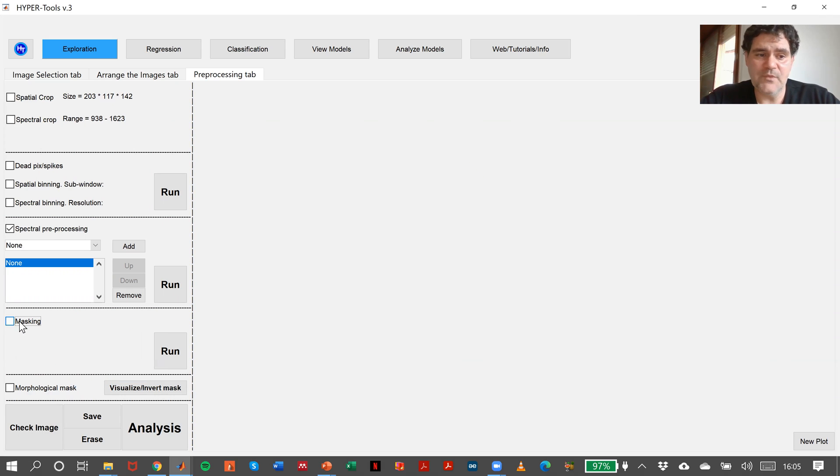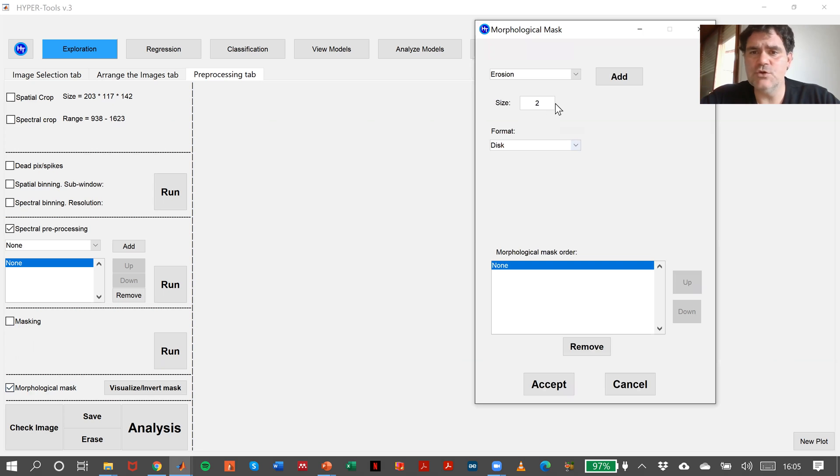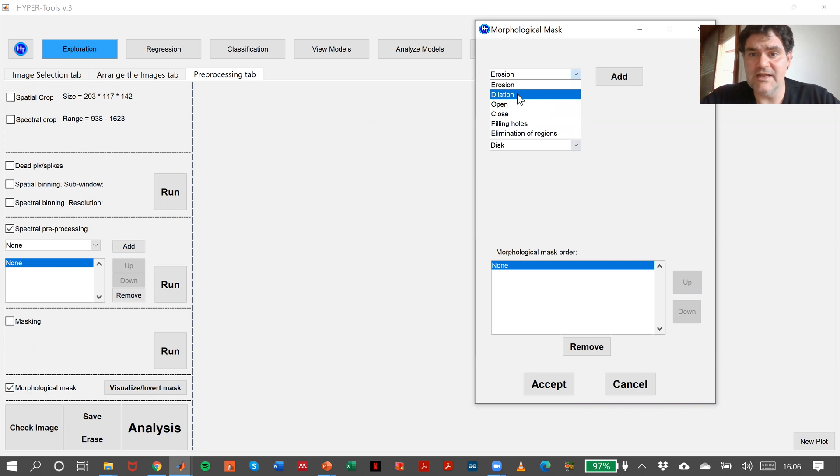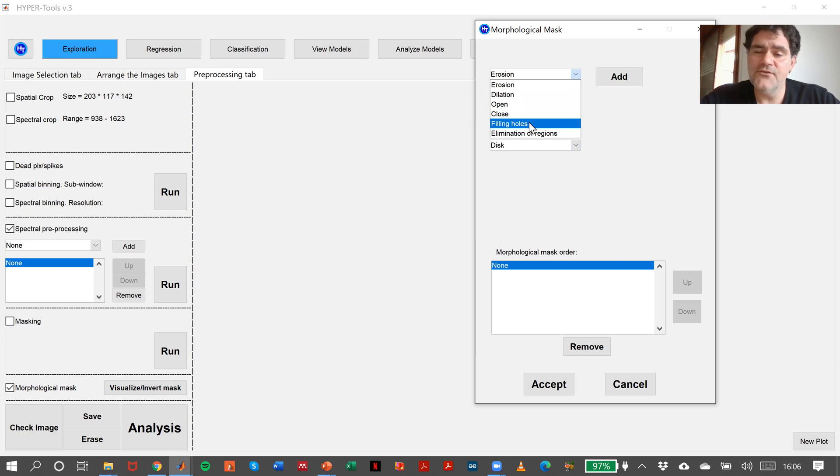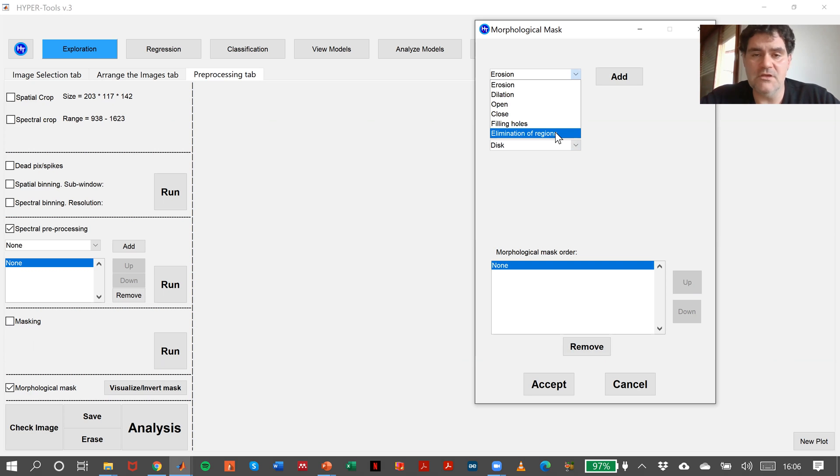And then, inside masking, if we need to refine the morphological mask, we can make some more morphological operations like erosion, dilation, opening, closing, filling holes or elimination of regions by size or manually with the mouse.